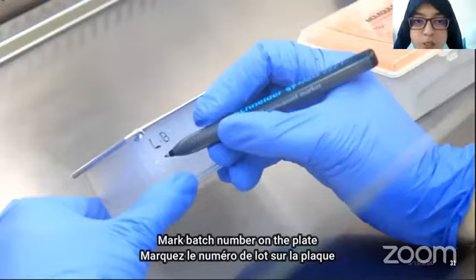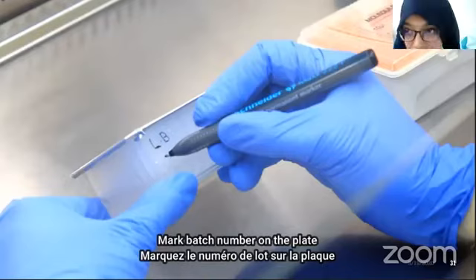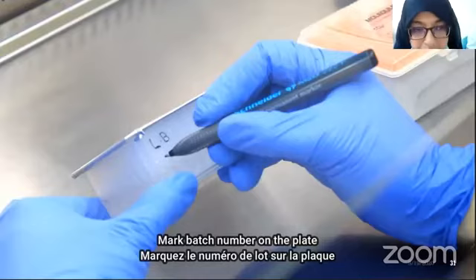Are you talking about the pooling of the samples? I think you are asking about the addition of samples in a single well. What I can understand from this, you can ask again, please. Basically, if we are talking about the deep well plate, we make the template and add the samples.